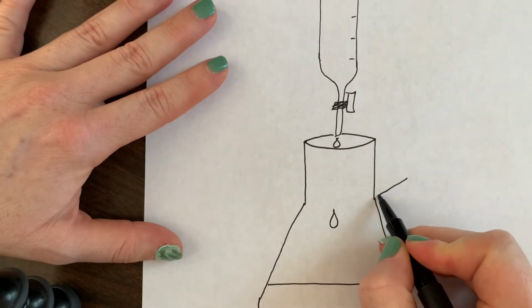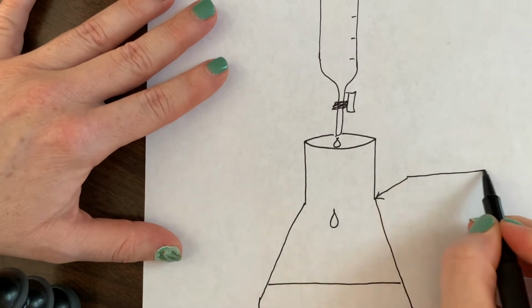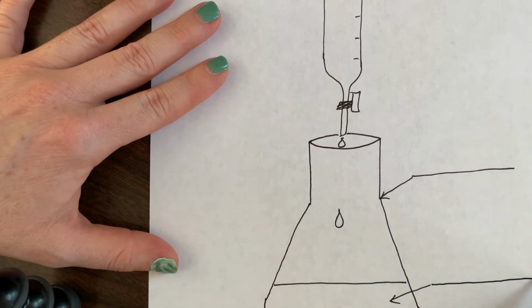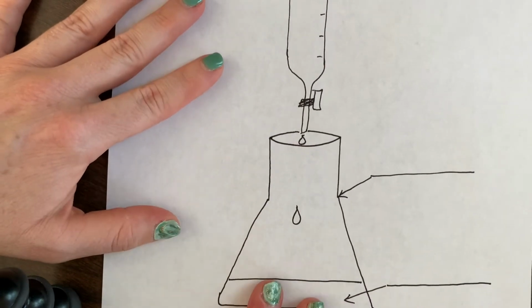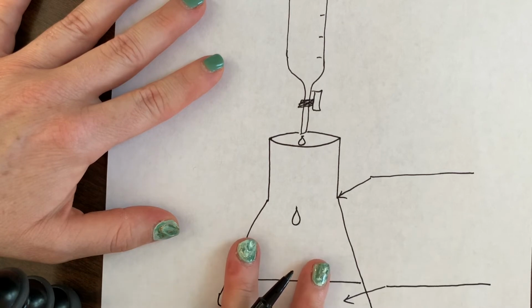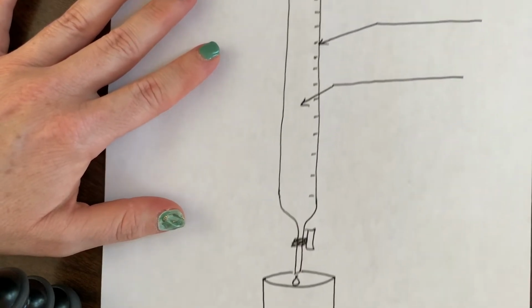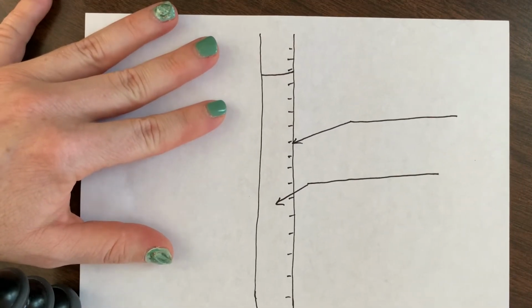And then this arrow will refer to this piece of glassware right here. And this arrow refers to the liquid inside. So, use pencil so that you're not afraid to make educated guesses, and pause this video and try and label this diagram. Don't worry about getting it right or wrong. We will go over it.